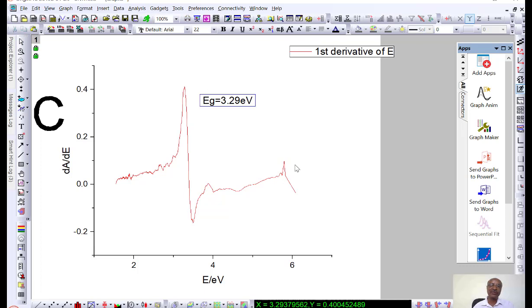In this way you can determine it. I have used the UV spectra of zinc oxide nanoparticle. You can take the UV spectra that I have plotted in the Google Class. I have also given them to you in the Google Class, so download those values and practice.